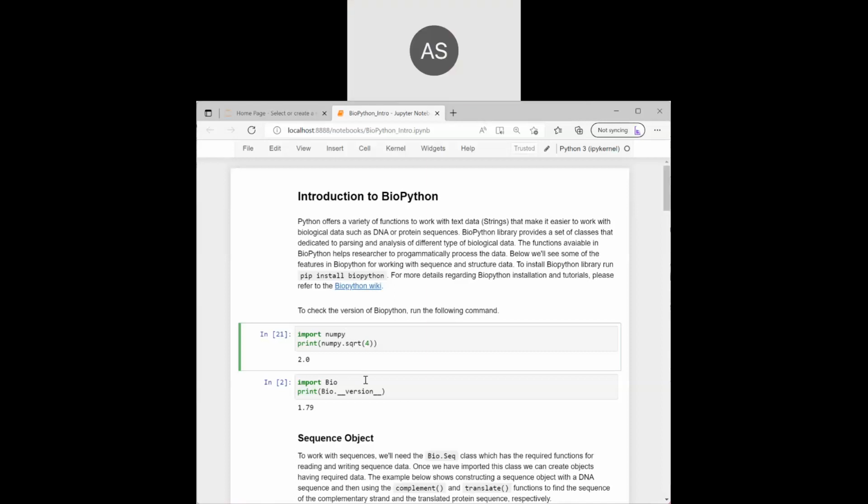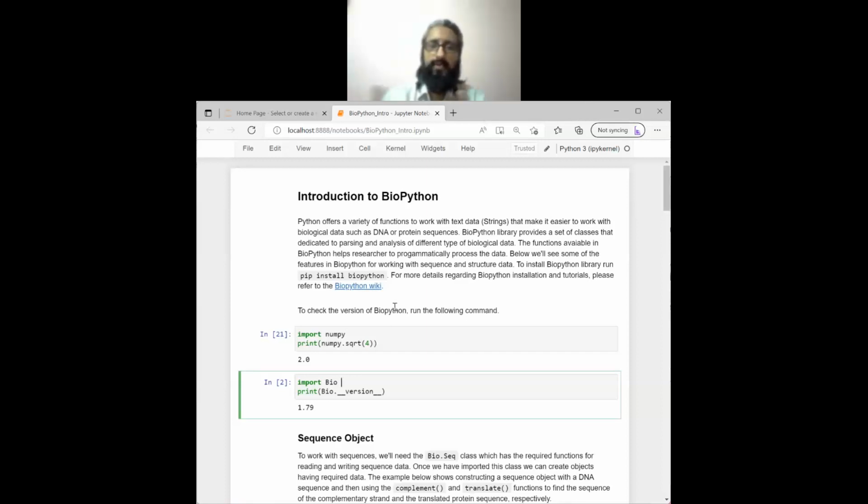Sir, you wanted to say that after installation also we will not be able to get it, so we have to always import from your computer, to get into the computer. Yeah. See, you install a program, and then you have to... just like in other programs as well, this is very common. For example, if you have installed MS Office, okay.